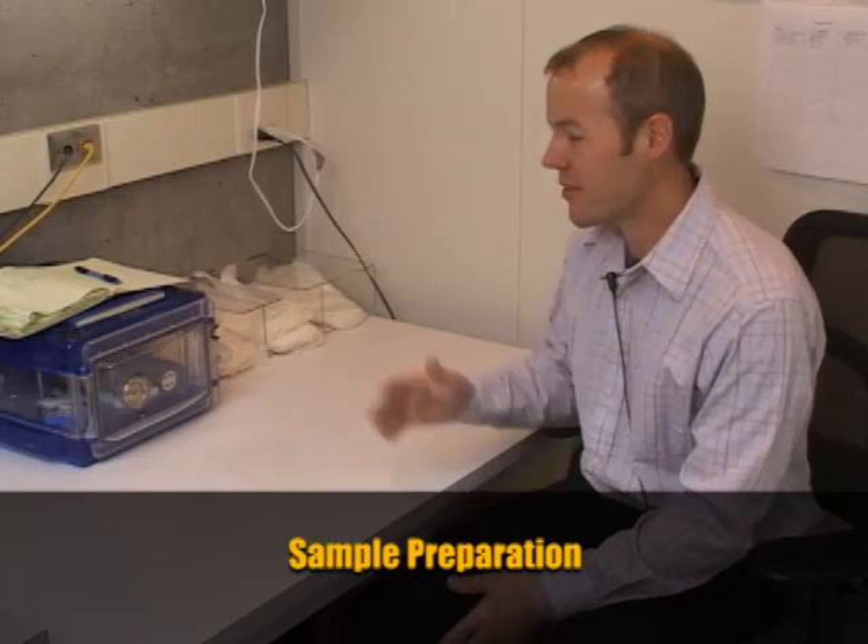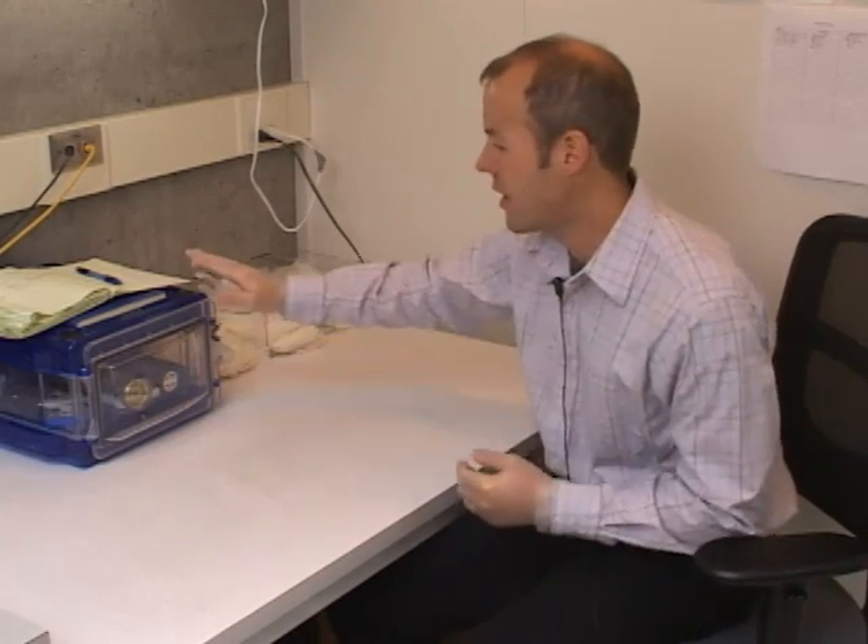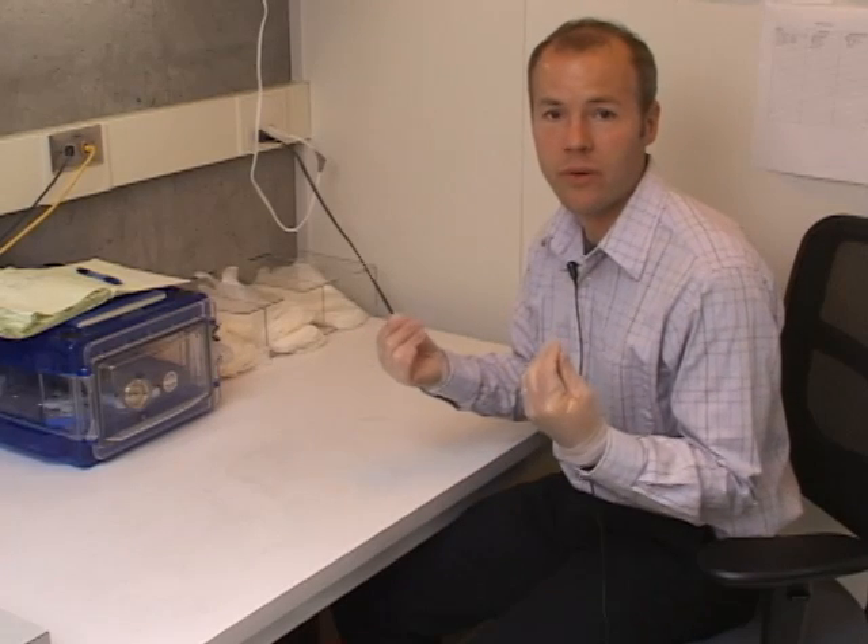Sample preparation happens in this area. Because we're putting a sample into a high vacuum environment — 10 to the minus 5 millibar — many things that exist as liquids or solids in normal environments can be vaporized. We keep the sample as clean as possible, avoiding finger oils and condensation. Samples are stored in a desiccator box, and we glove up with vinyl gloves to avoid depositing any material on the sample.